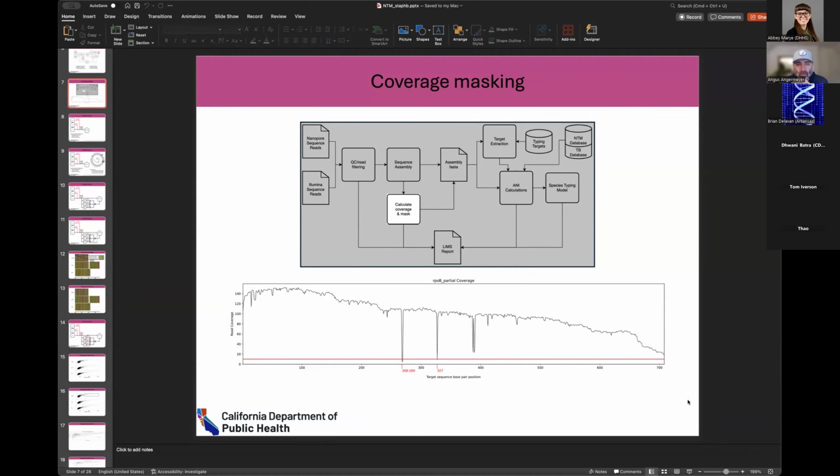The question I have is around 10x: when you see these one or two base drop-offs, how do you know that it's not a real deletion? I don't think the 10x coverage cutoffs were meant for a single base, because then you'll miss deletions, right? How would you treat them?